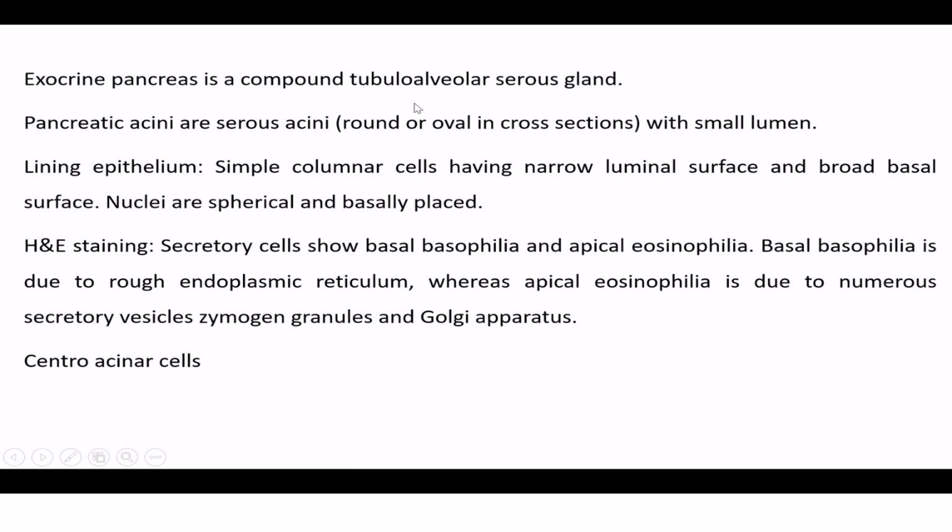So exocrine pancreas is a compound tubuloalveolar serous gland. So pancreatic acini or serous acini are round or oval in cross section with small lumen. Lining epithelium is simple columnar epithelium having narrow luminal surface and broad basal surface. Nuclei are spherical and basally placed.